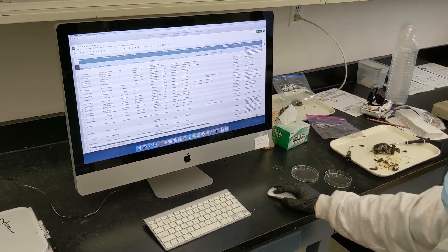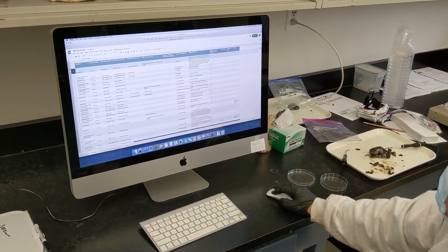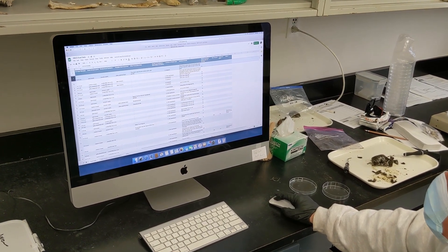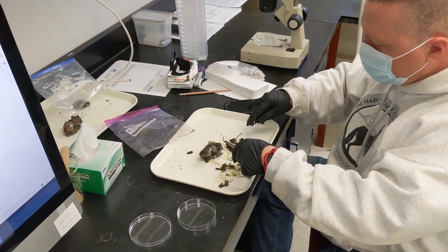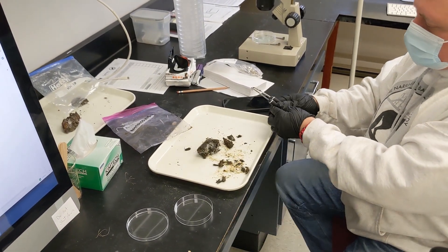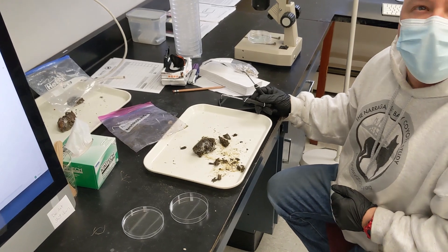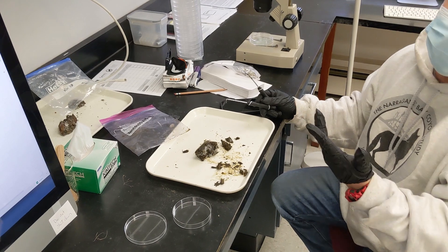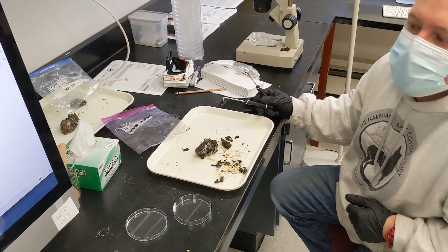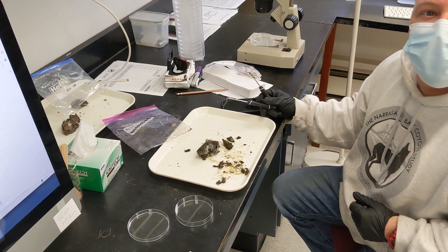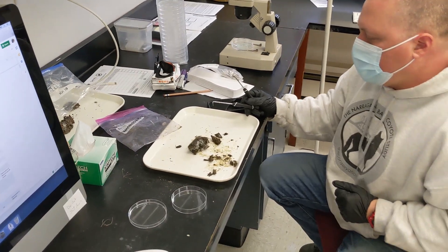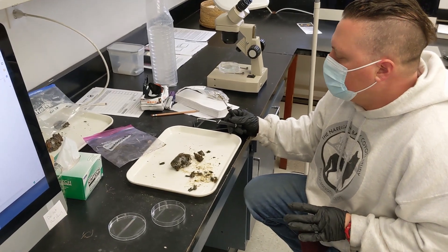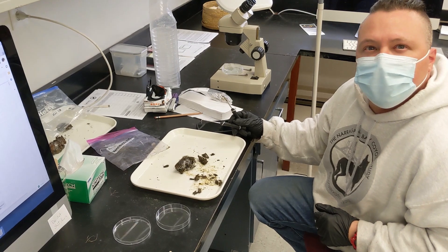I'm careful not to read where it was collected or what the collector felt was in the sample, because I don't want to bias the results. Right now we're just looking for physical evidence of deer. I make notes if there are other things present, like woodchuck or meadow vole. The fur makes it through the digestive system really well, so fur is the main thing, but there can be bone for sure.